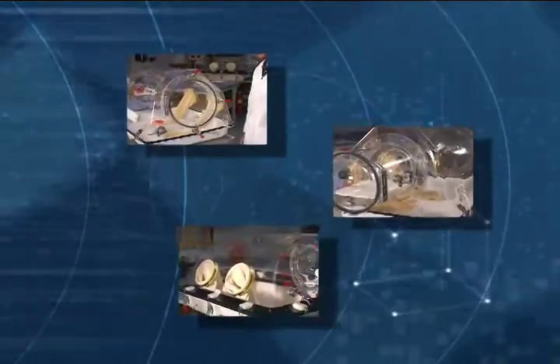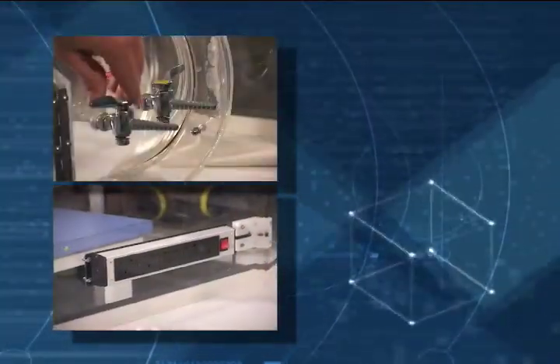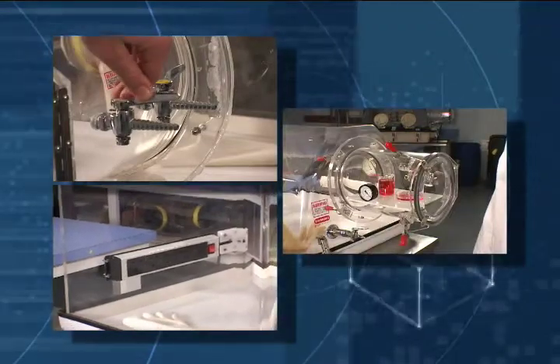Our three most popular glove boxes all function the same way, but have different shapes. All units have the same features: electrical outlets, gas valves, and transfer chamber with tray and pressure gauge.